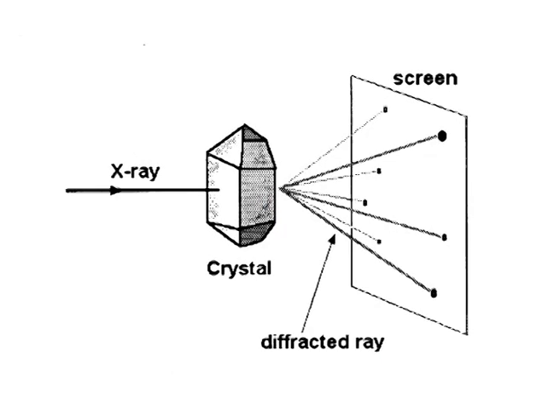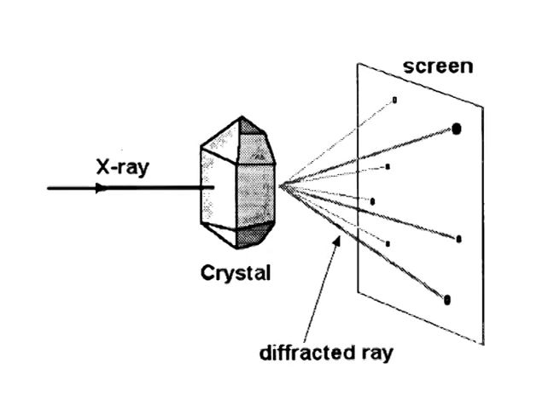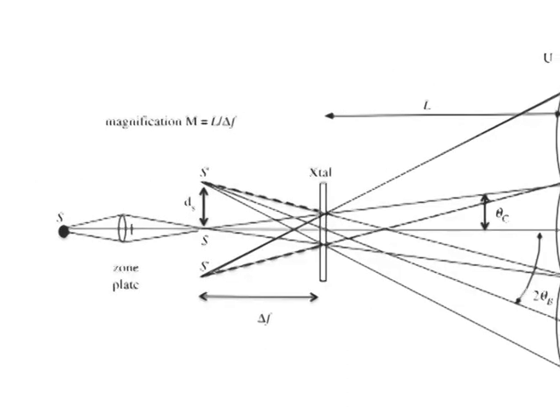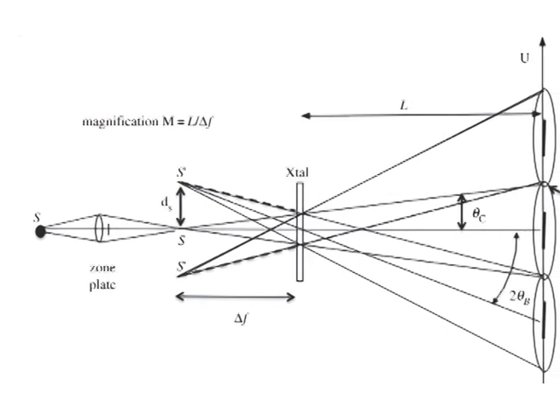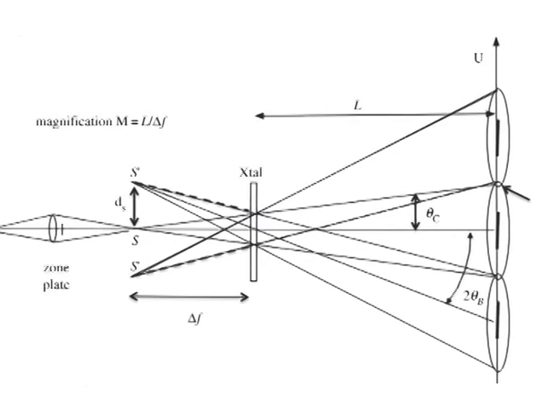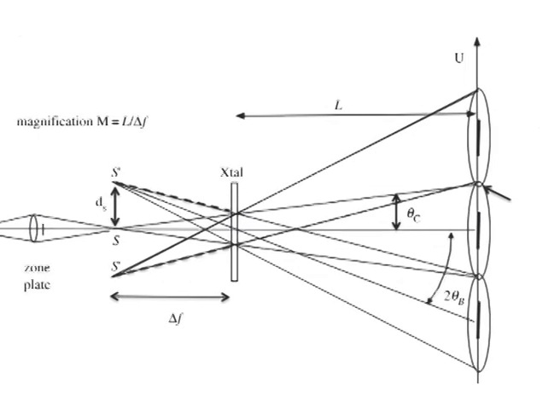In order to solve a crystal structure, it is necessary to record a large number of reflections. This implies accurately measuring their intensities and recording their direction with respect to crystal orientation and initial X-ray beam direction. Many experimental techniques have been devised to achieve this.